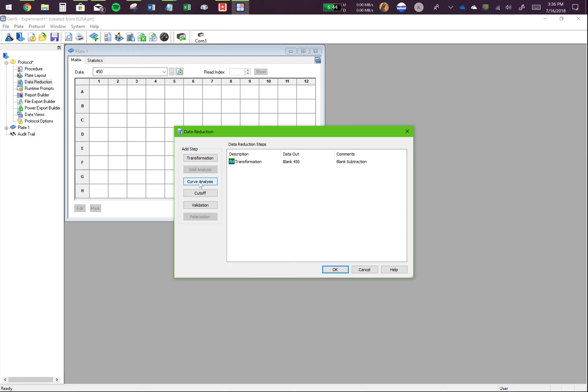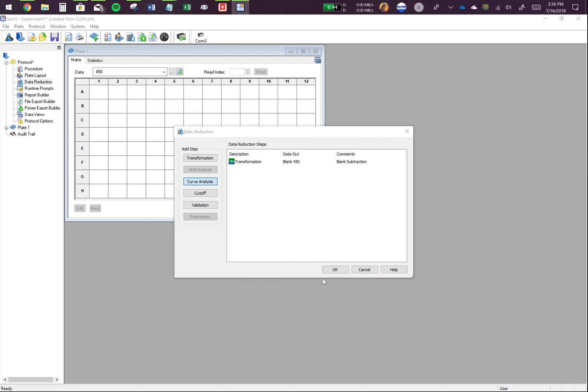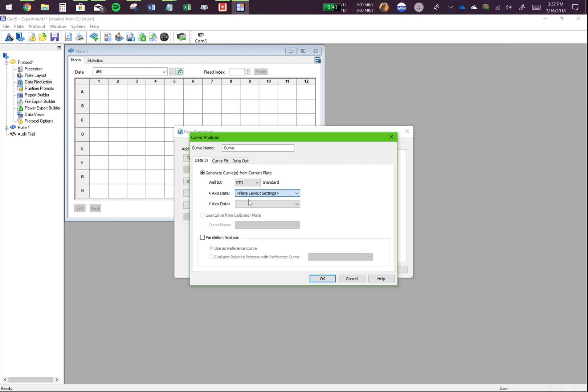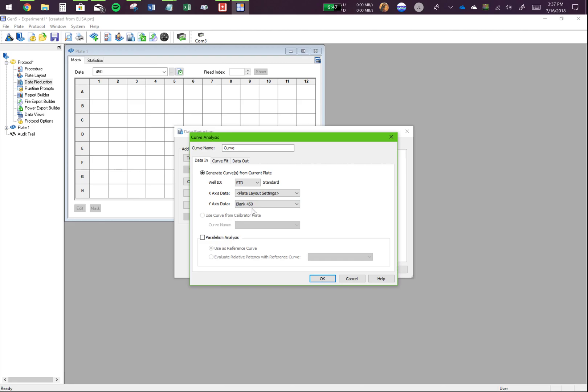So you click on curve analysis. Well, ID is standard. Your X axis data is going to be your concentration. So plate layout setting means whatever is the other parameter other than the absorbance that's going to be plate layout setting. So I want to make a graph that has X axis as concentration, which will be my plate layout settings and Y axis as my absorbance values.